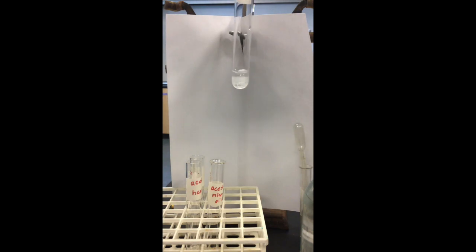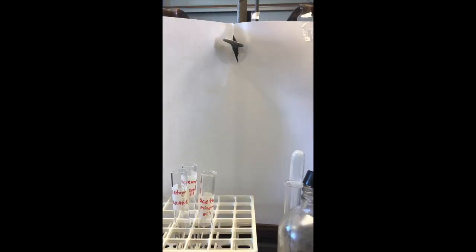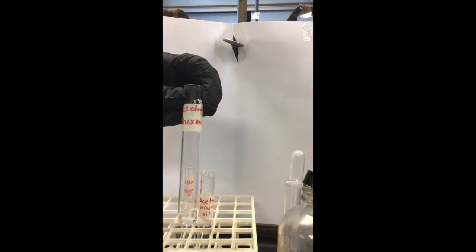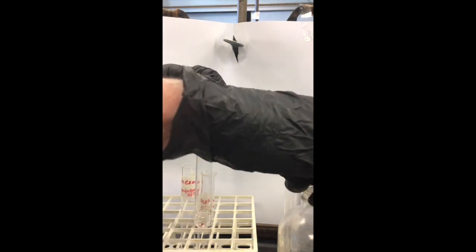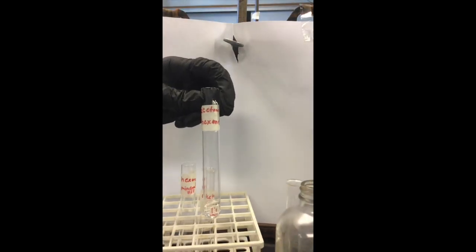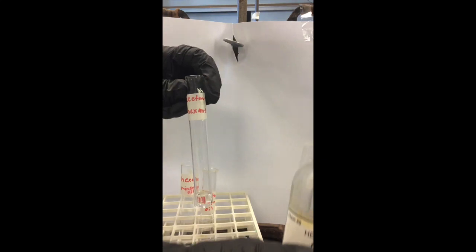And for some of these, it may not completely dissolve, but if it partially dissolves, we would call that partially miscible. In between the two, where maybe part of it is dissolving in the other liquid of one solution. Our next sample is acetone and hexane. I've already measured out the 1 milliliter of acetone, so I need to add our hexane to the sample.